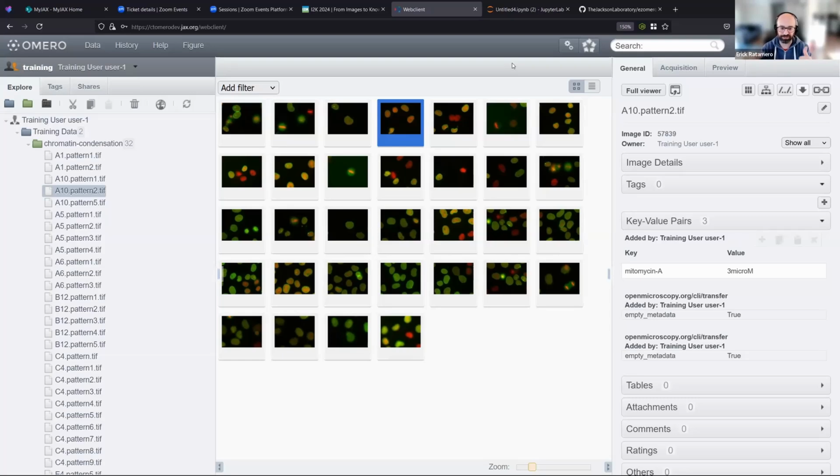And that is a process that is, one, very time consuming and processing heavy, two, very prone to errors. And this is something I have faced in the past as well. So yeah, if you have very large single plane images that don't have pyramids, it's a good idea to convert them to something like an OME TIFF before importing.